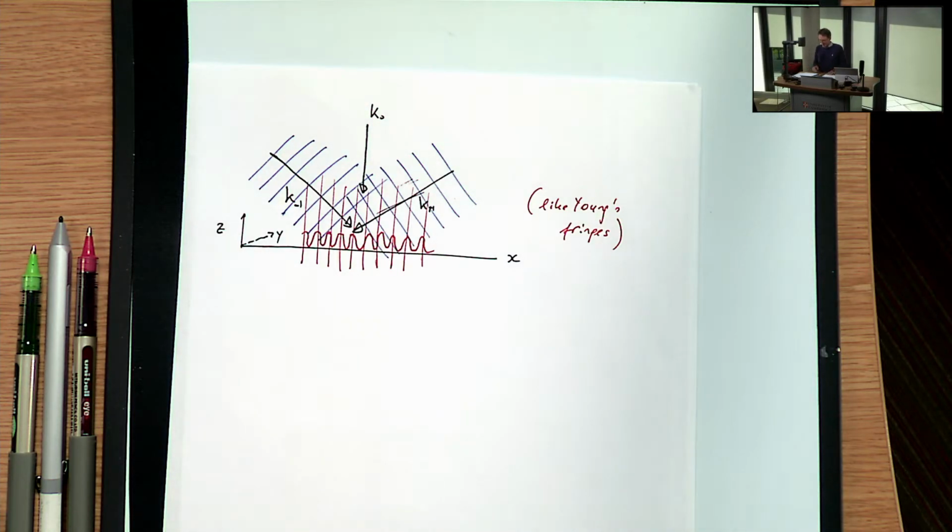In fact, you get a light lattice, with bright and dark dots arranged in 3D. So you get modulation not just in X and in Y, but also in Z. And that really allows you then to get resolution enhancement in all three directions.